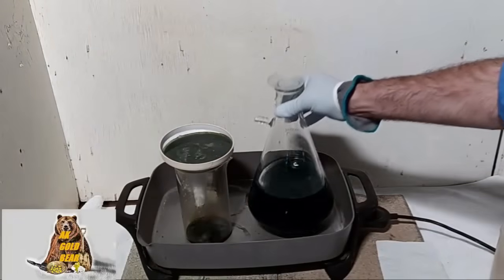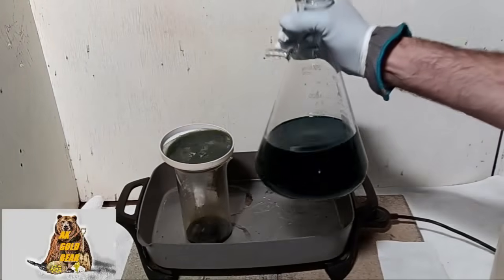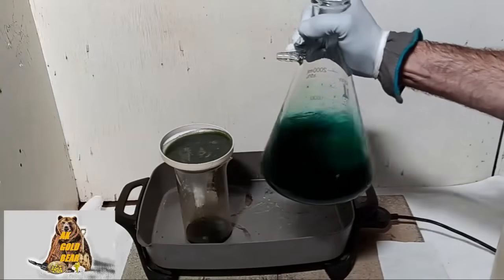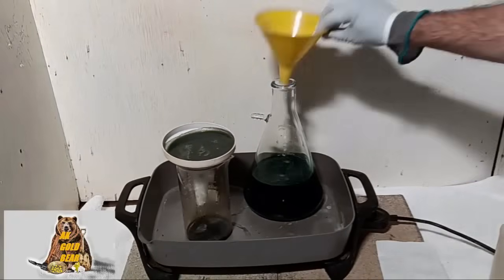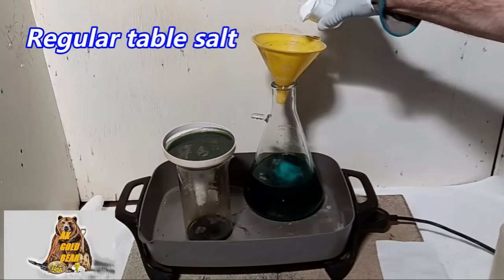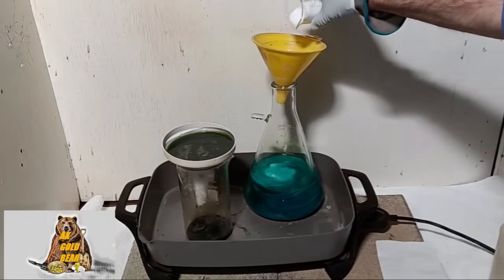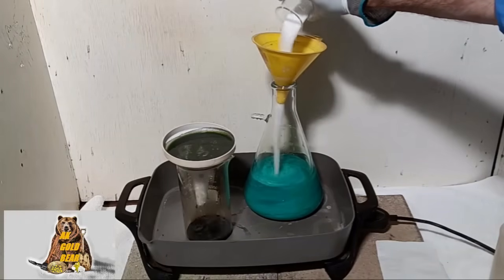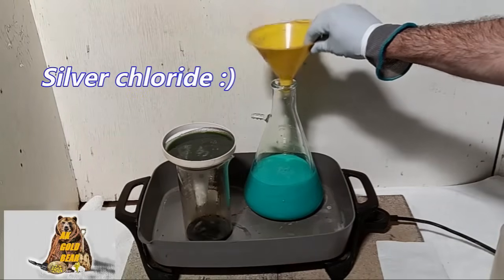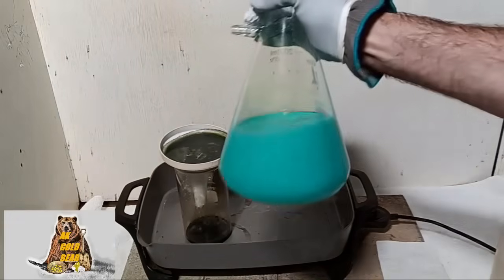I'm going to try to extract silver from this solution — I'm not sure if there's silver or not. Salt. Oh yeah, there's a lot of silver. Very good.